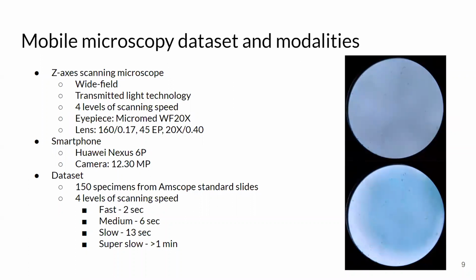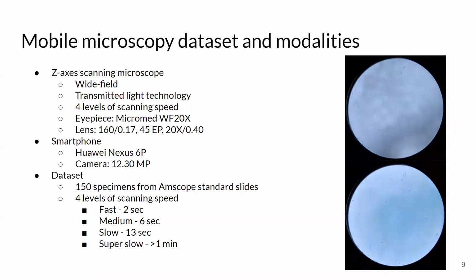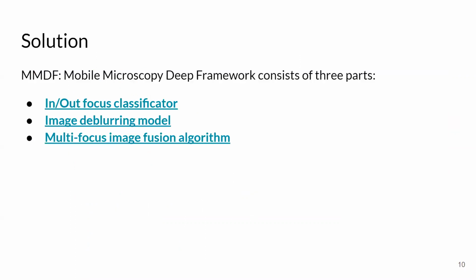Okay. Well, as said above, we have 3 problems, and our solution, which we called Mobile Microscopy Deep Framework, or just MMDF, is a solution for these 3 problems. The first of these problems is in-focus and out-of-focus image classification.